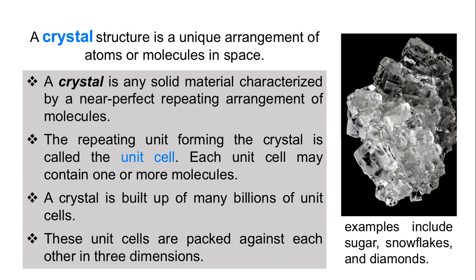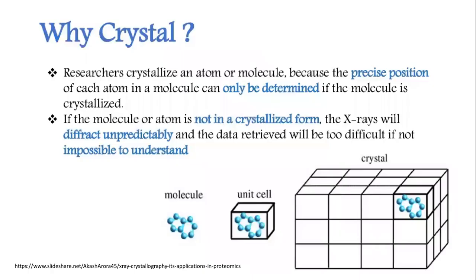So how exactly is the study of the crystal structure becoming very important? We all know in the case of proteins, the structure of the protein greatly influences its function. So we understand that when there is a change in structure, there could probably be a change in the function. And sometimes this little change in the structure could ultimately result in a drastic change in the function, which can sometimes be lethal as well. So that is why the study of crystals is becoming very important.